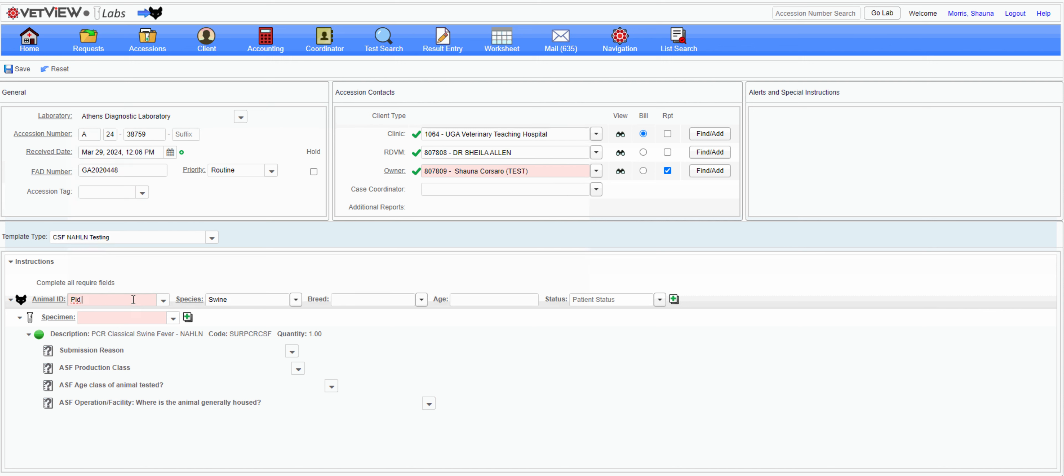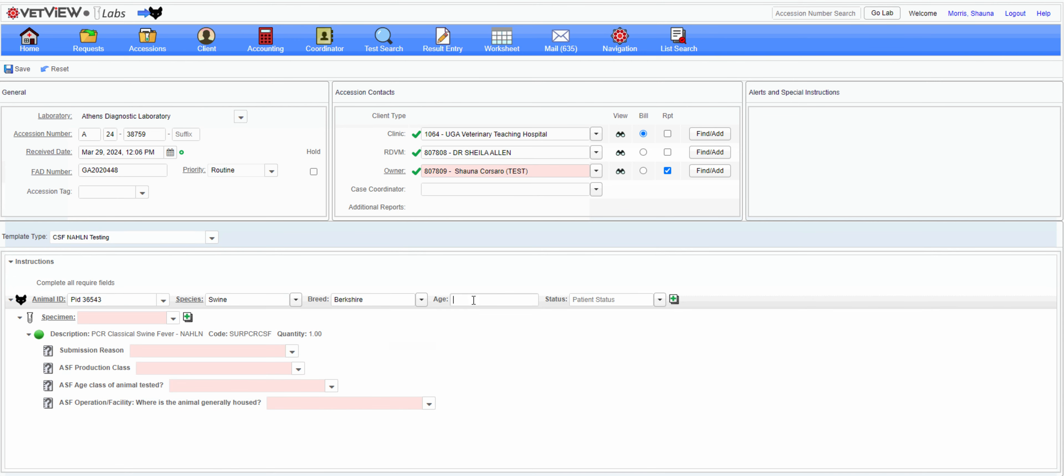If utilizing the online request feature in the portal, the same process will be followed for cases coming directly from the submitter.